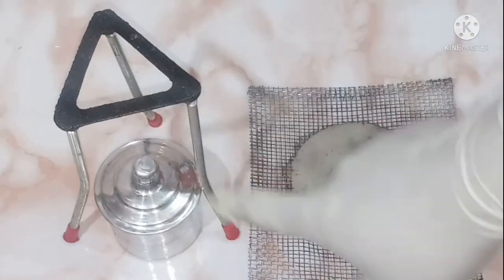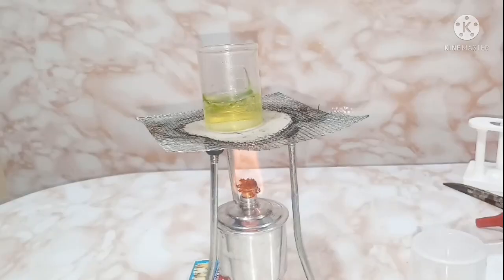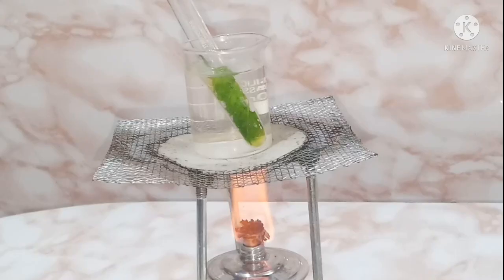Using a tripod, a spirit lamp, and a wire gauze, boil the leaf to soften it. Then place the leaf in a test tube and fill it with alcohol. Boil it in a water bath — since alcohol is highly inflammable, you need a water bath. This arrangement is known as a water bath.